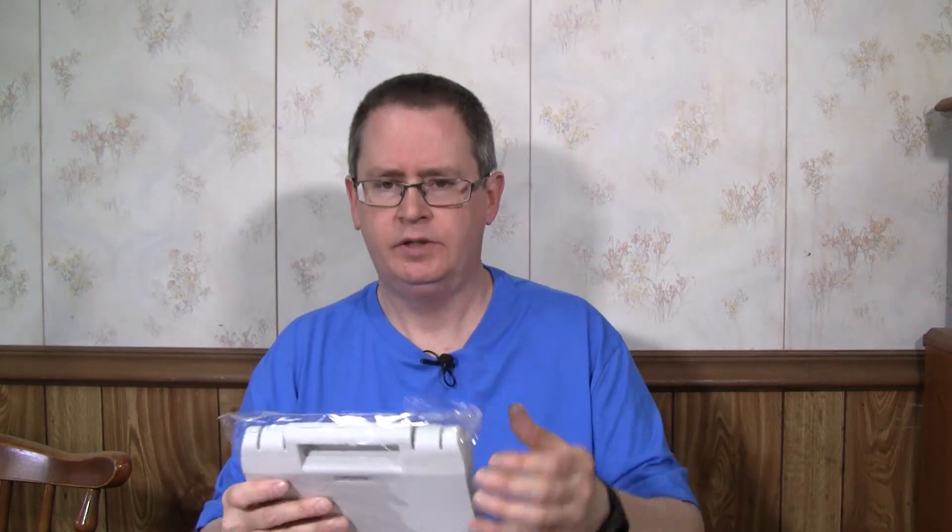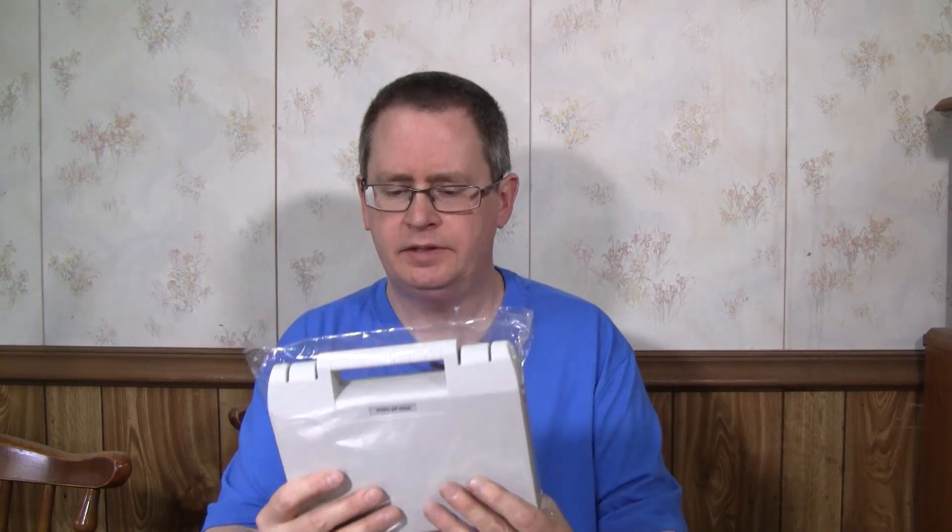It was in a bubble envelope — I already took it out and it comes in a little carrying case. So basically the reason I bought it: I got it on Amazon and it was around $48.